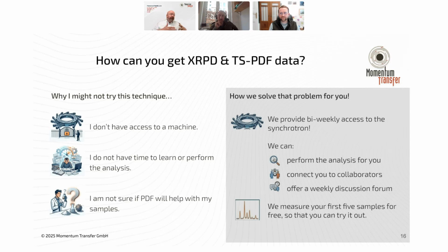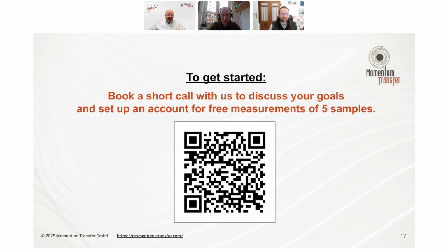And while you do that, we're happy to measure the first 5 samples for free. And afterwards, it's not that expensive. So for academics, our prices start at 110 euros and go down rapidly. And yeah, we have users from the US, and it is not hard to send samples. So yeah, you can just go here.